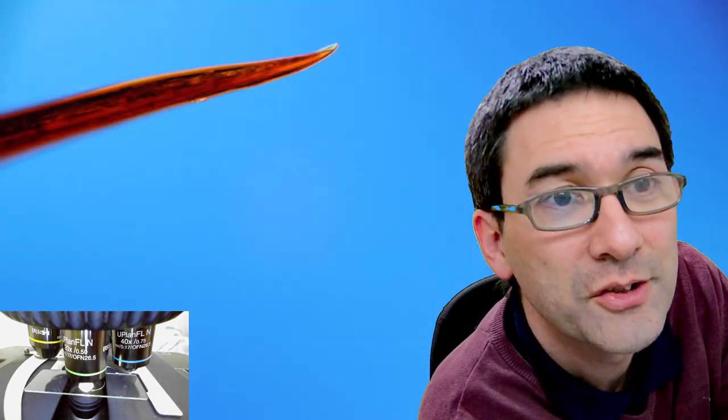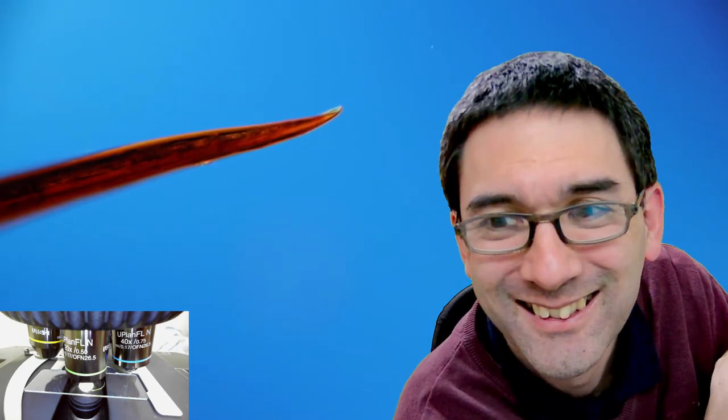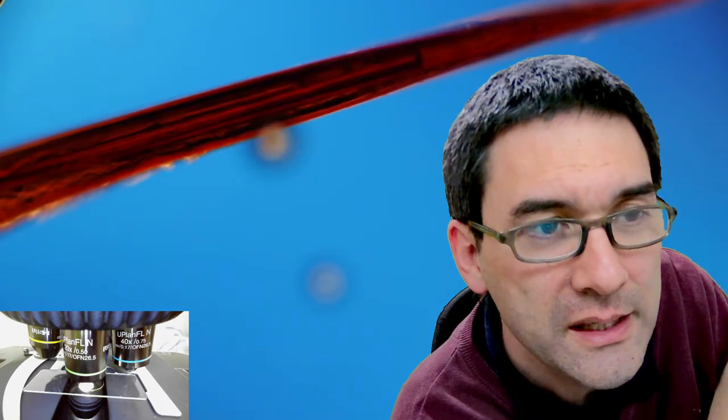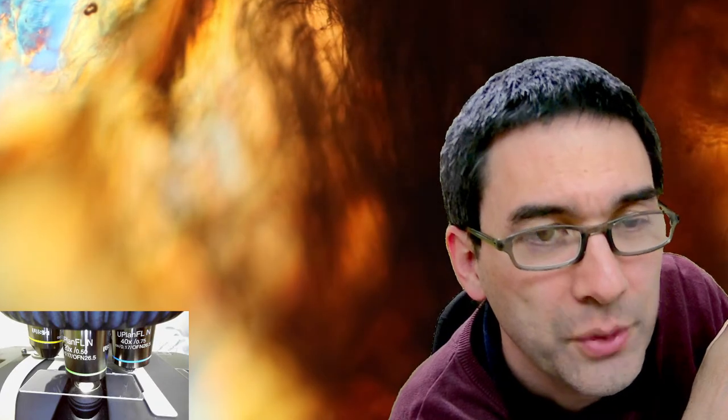I'm using another 10 times. I'm not going to go higher than 20 times. Okay, and I'm going to put on the DIC. Looks kind of nice with the colors, you know? Yep, the bubbles might actually disappear. Sometimes as the medium dries, the bubbles are pushed to the side. And this must somewhere be here, the poisonous gland.